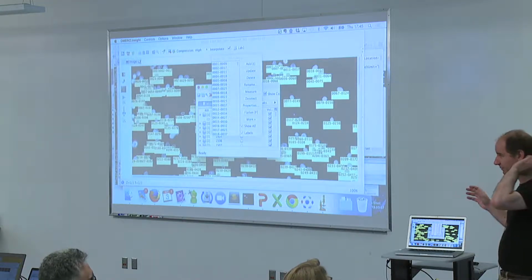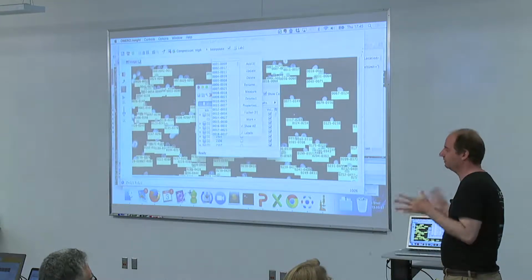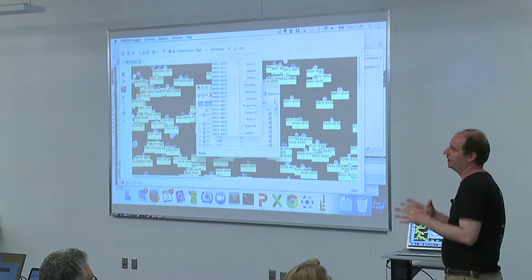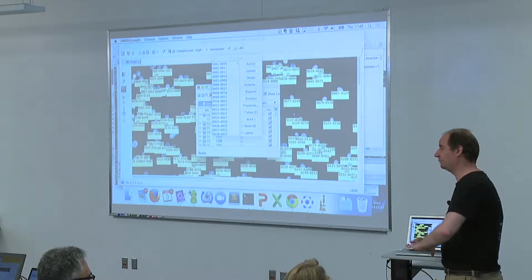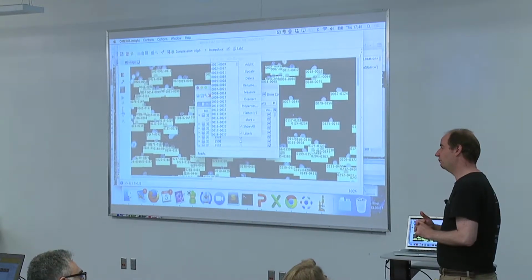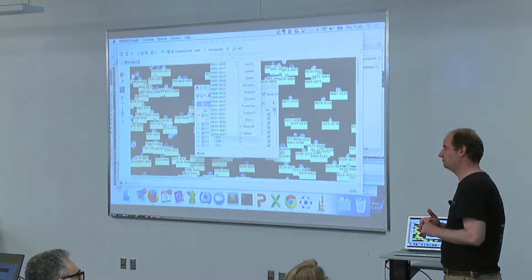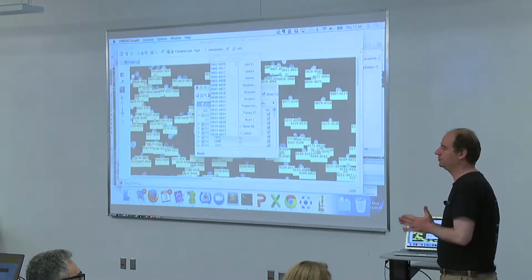First of all, we will have to put into our model an image link as such, and or we will sort it out in other ways, but this is something that people ask for very much. What is the other idea which you might find interesting is to use the ImageJ recorder to do the job for us.